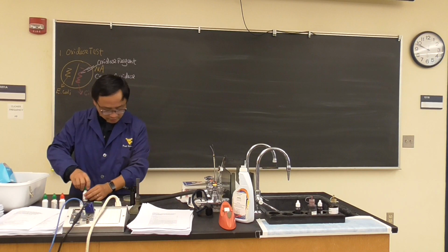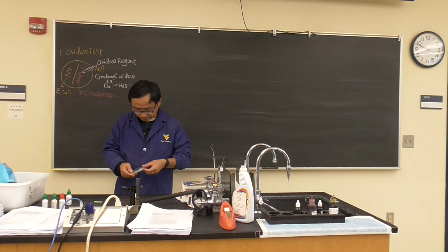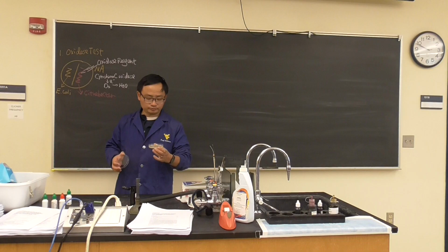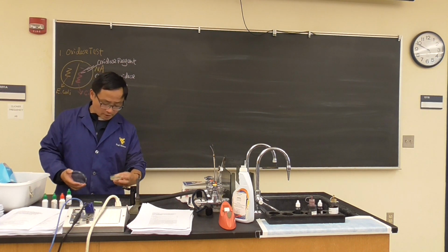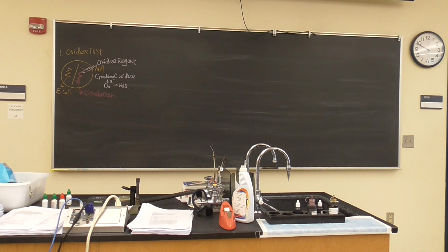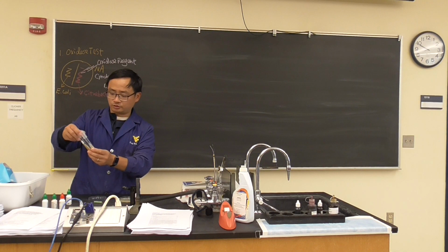If nothing turns purple, then this may not be Citrobacter, because I didn't see anything turn purple. Do you see anything turn purple? Okay, that means it's not Citrobacter. Let's see some other slants. I'll get a slant from Bacillus. I'll get a slant from Citrobacter. Let's see, is there anything change? Because I didn't see anything different on the plates. So I'll get a slant which is Citrobacter.